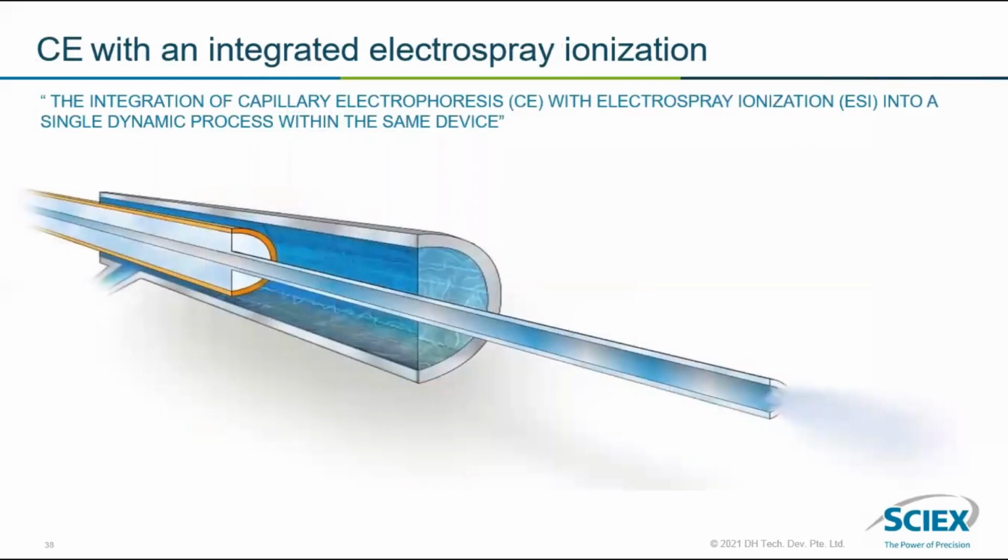So in this picture, you can understand more about how the CESI technology works. Basically, we have a capillary which is made of bare fused silica, and what we have done with this bare fused silica capillary is we etch the capillary ends with hydrofluoric acid to make it more porous. So when we inject the sample, it will give an ultra low flow of your sample and the buffer. And then the second capillary, which is the shorter capillary in the previous picture, we fill with the conductive buffer. Just to take an example, what we use for the CESI experiments is acetic acid of different concentrations.